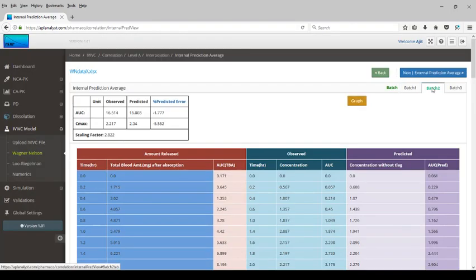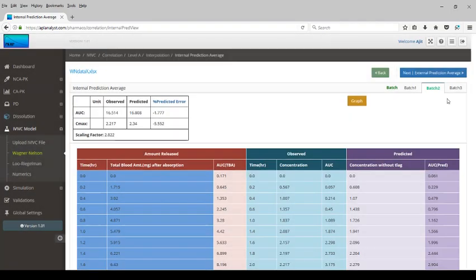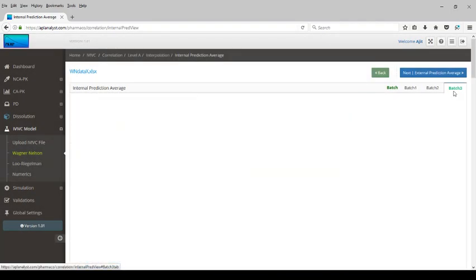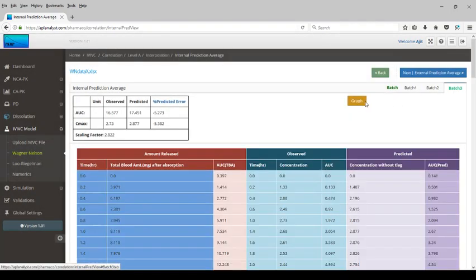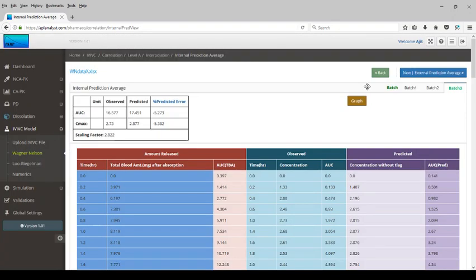The same analysis can be done for batch 2 — the observed versus predicted plot is shown. Similarly, for batch 3, the observed versus predicted plot is displayed. This completes the IVIVC correlation analysis.